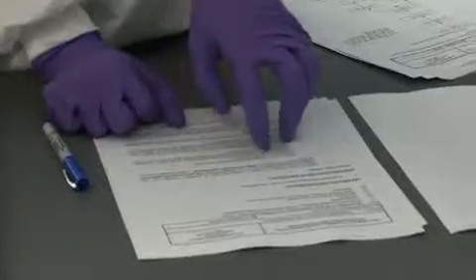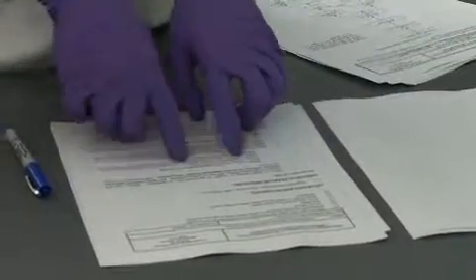And in the DNA analysis, we'll actually extract the DNA out of it and eventually get a DNA profile that will be compared against the question samples versus the known samples from both the victim and the suspect, to say whether or not it's a potential match between those two.